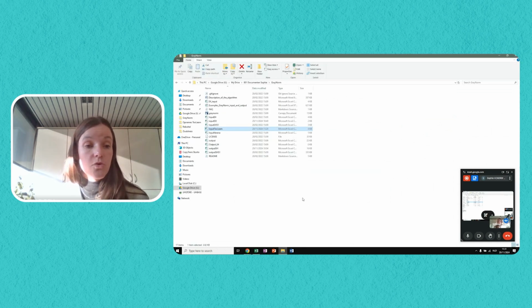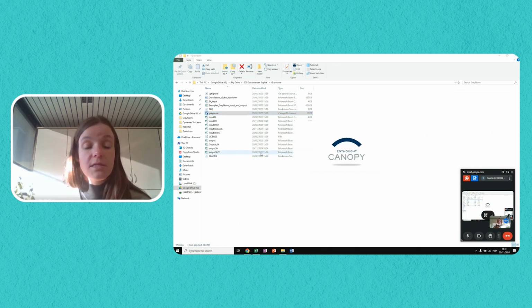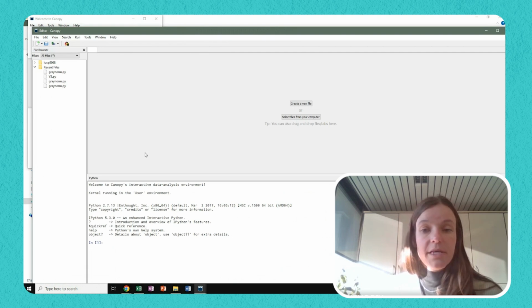So I will now go to my GreyNorm folder. And what I will do is I will click the GreyNorm file. This is a Python file. And normally when I double click it, it will immediately open it in the necessary software. Okay, there we go.